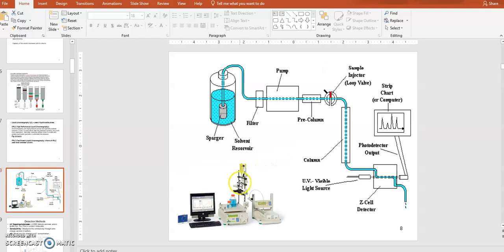So this is the makeup of your column chromatography system normally. There's going to be a column right here. Besides the column, you have the mobile phase container, that's a buffer tank, right? You should have enough mobile phase to run through all of your molecules and capture them. Your target molecule will be eluted and captured here. Probably you will have something like fraction collectors at the end. And then the pump will generate a continuous flow of your mobile phase. There's going to be some kind of pump, maybe a peristaltic pump or something like that.